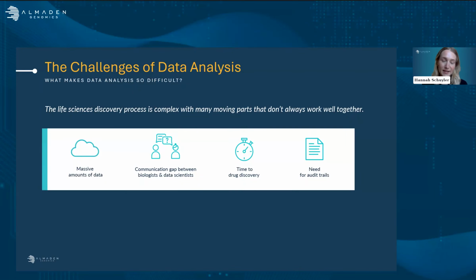When it comes to analyzing the data, the biologist is often relying on the bioinformatician, and it's not always a streamlined process. And this ultimately will slow down the time for analysis and discovery. And there's also a need for transparency and organizational systems to track and reproduce methods for future experiments.